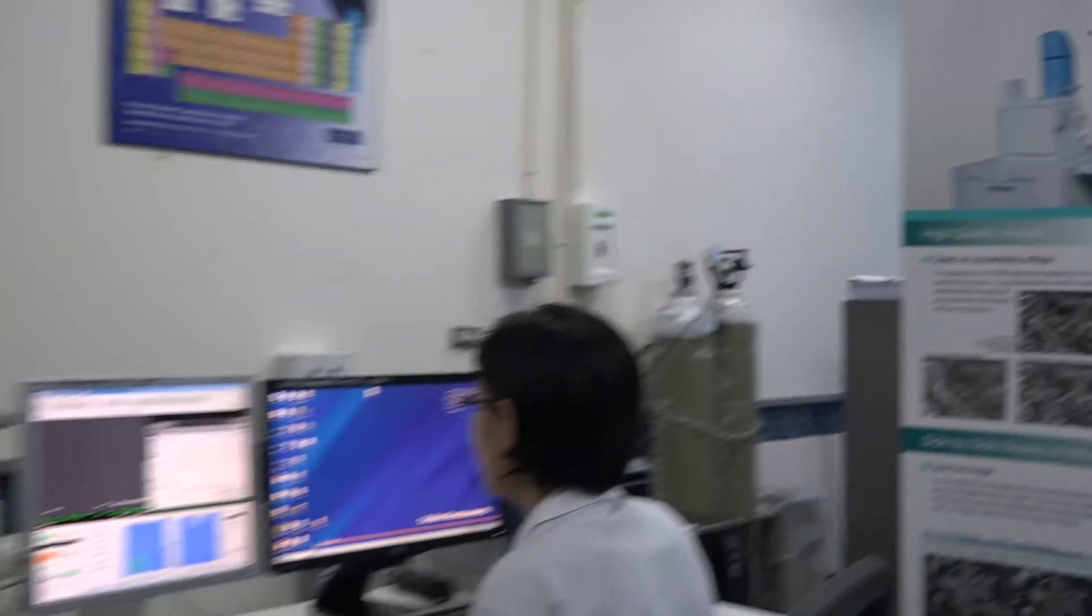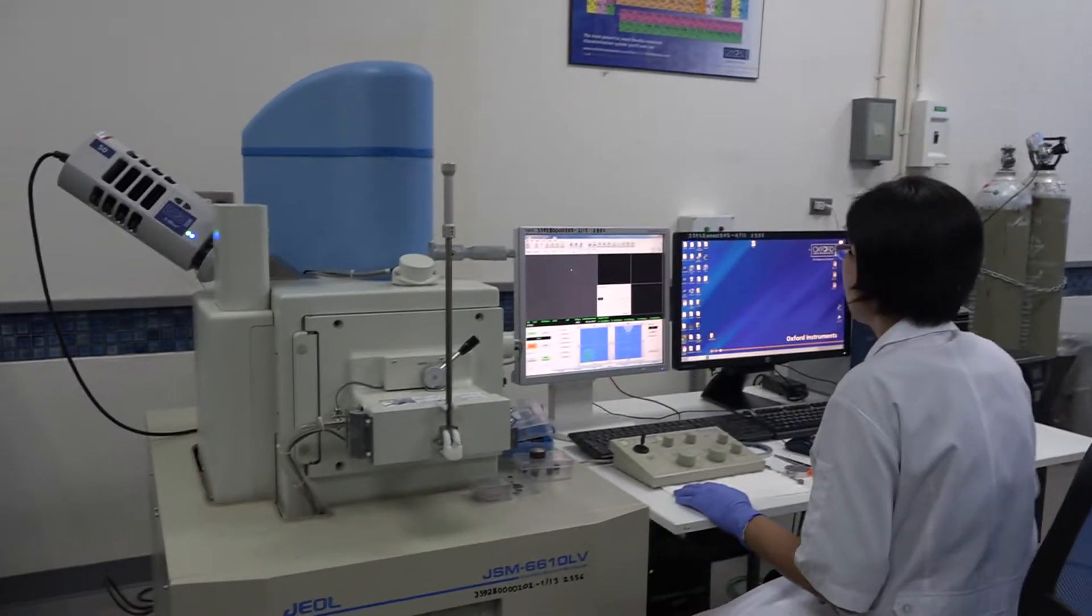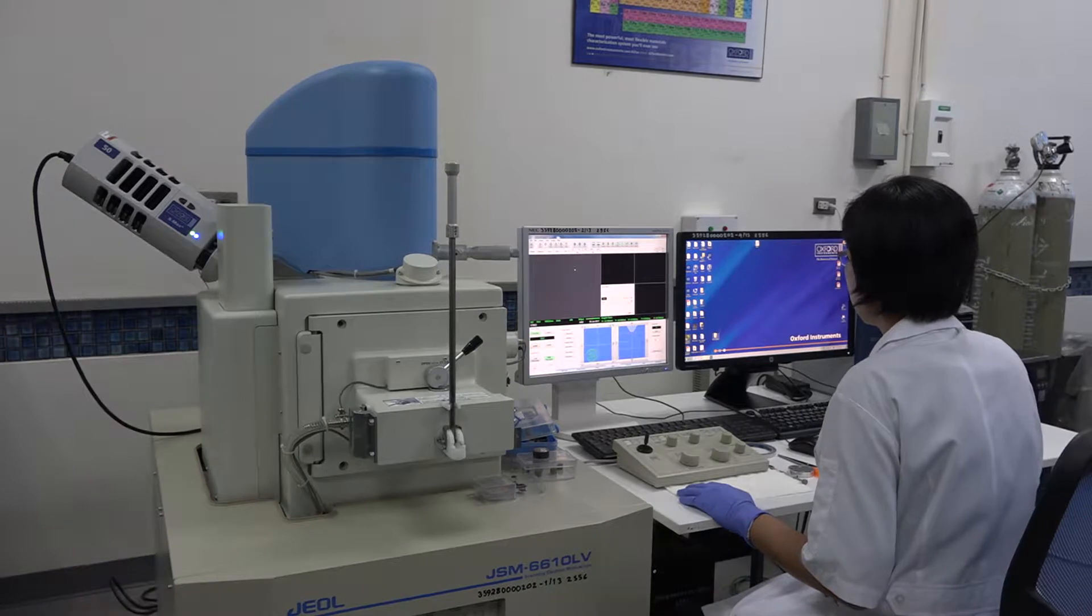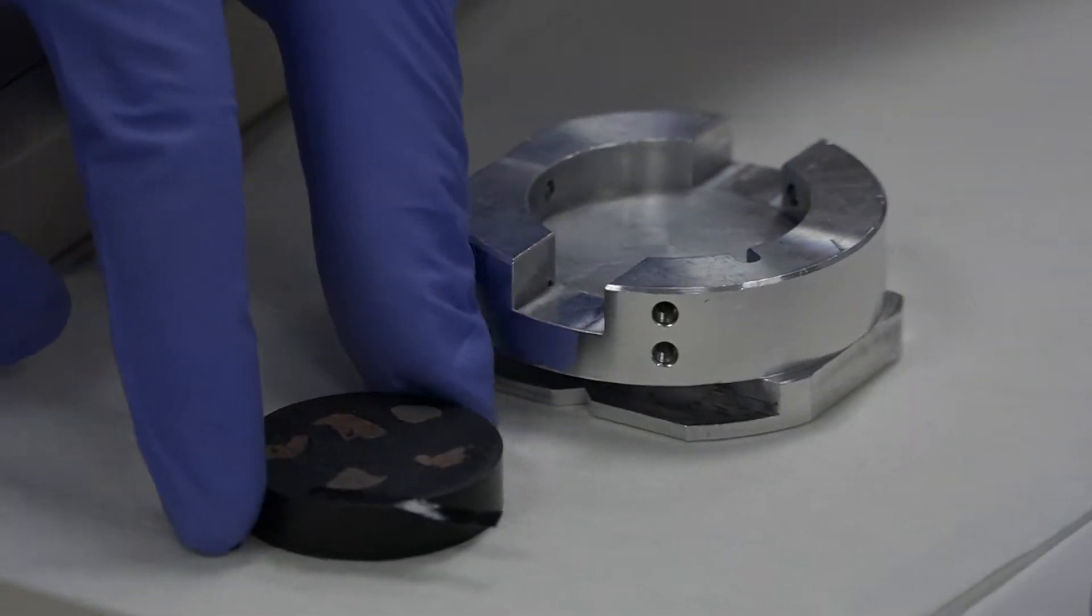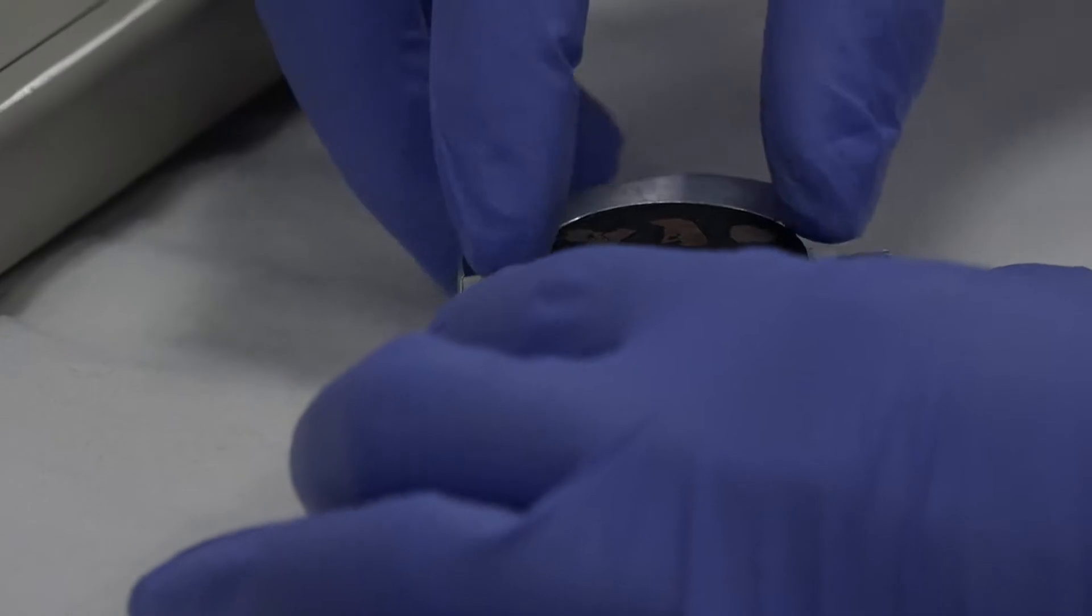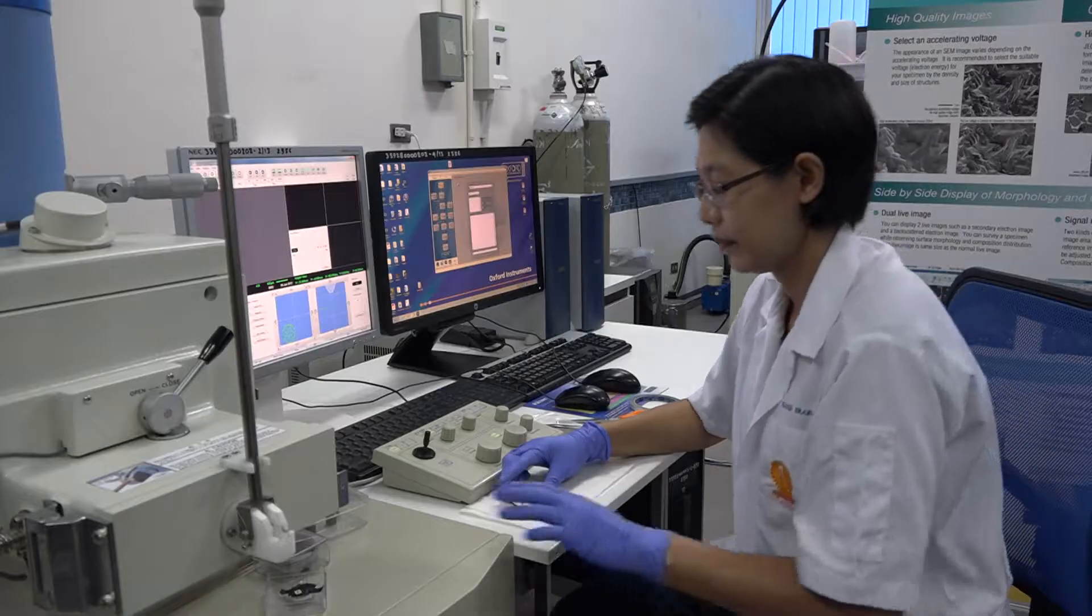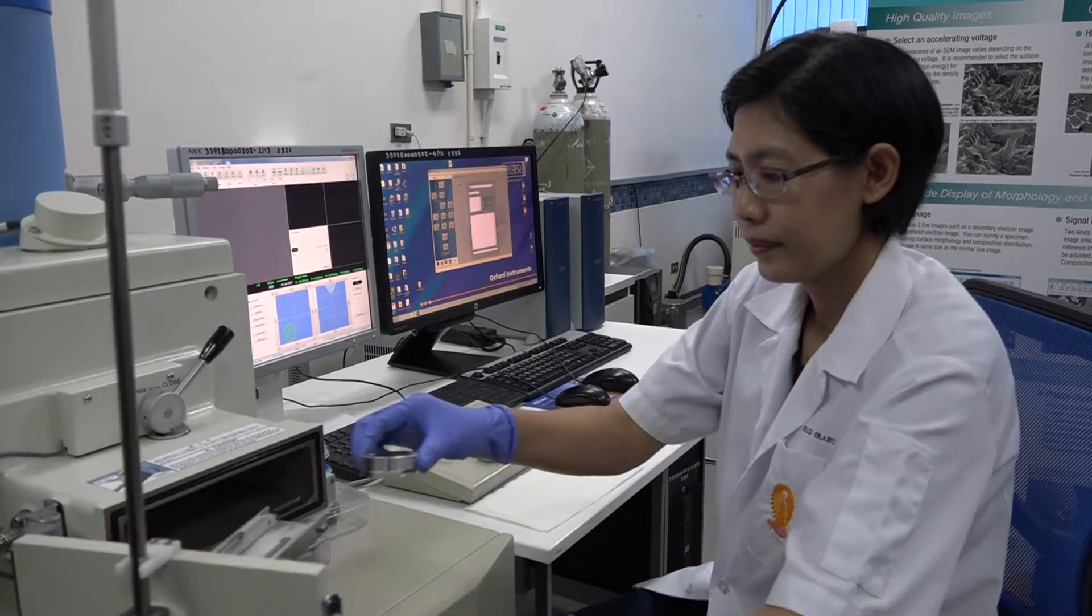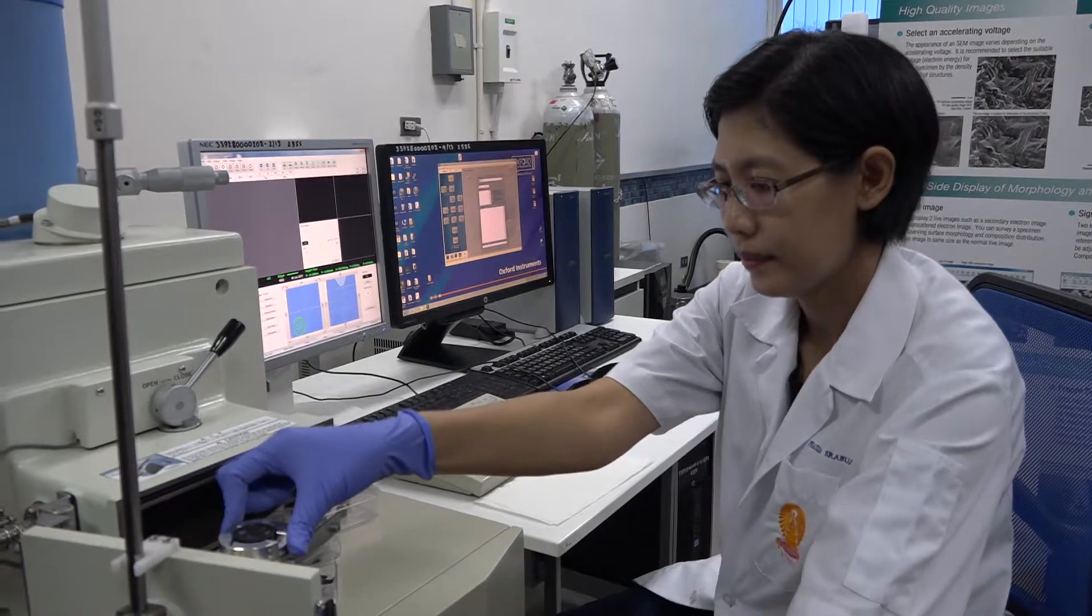Scanning Electron Microscope and Energy Dispersive X-ray Spectrometer, Model JSM6610LV and XMAX50.